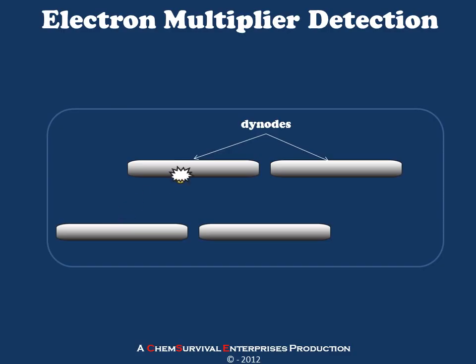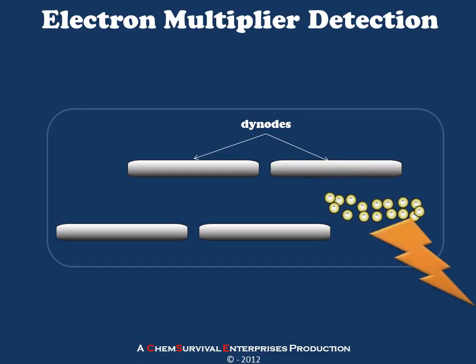This electron traverses the electron multiplier assembly and strikes another dynode. Now in this case we're going to produce 3 electrons per impact. So our 3 electrons move to the next dynode where there's a new impact, which creates 3 more per electron for a total of 9. And then a new set of impacts creates even more. And very quickly, a measurable amount of current is generated.